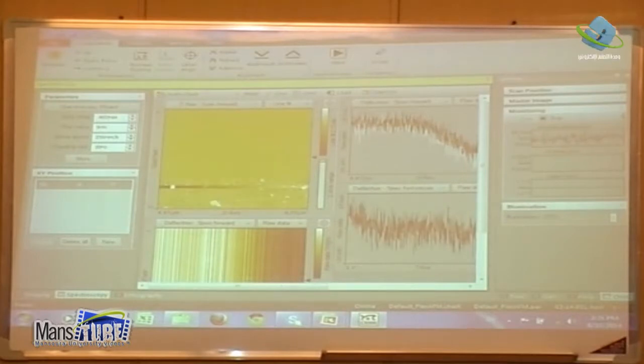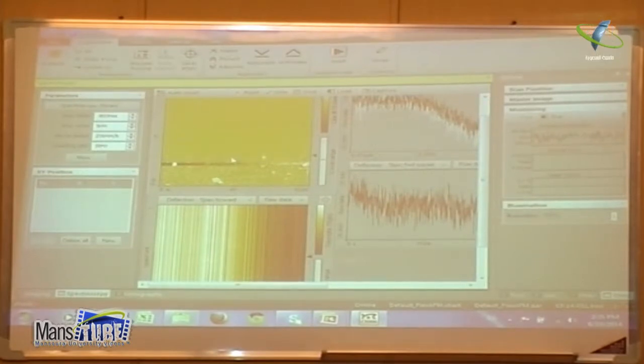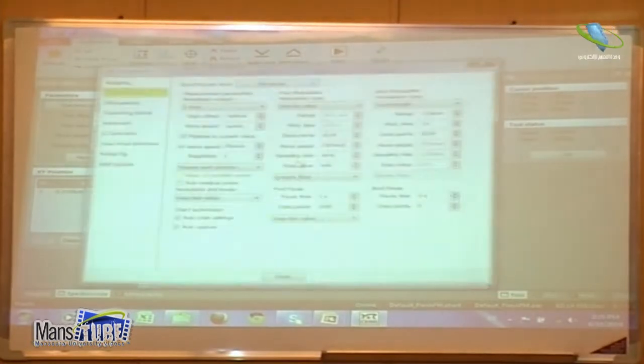Okay, I have the image now. I want to make a new measurement. I will just take 1 point. I will go to more.